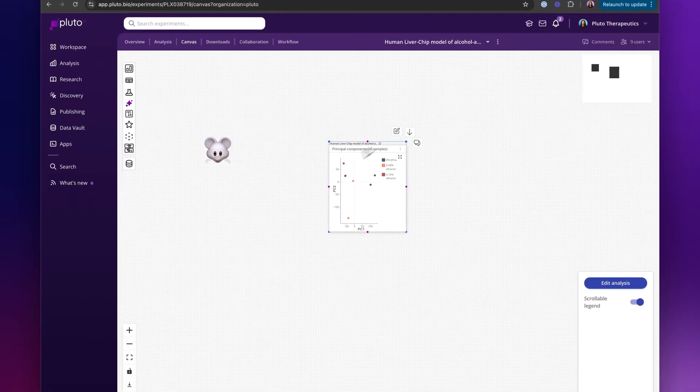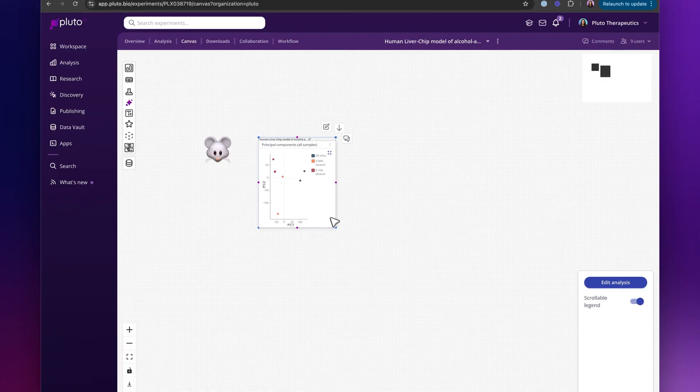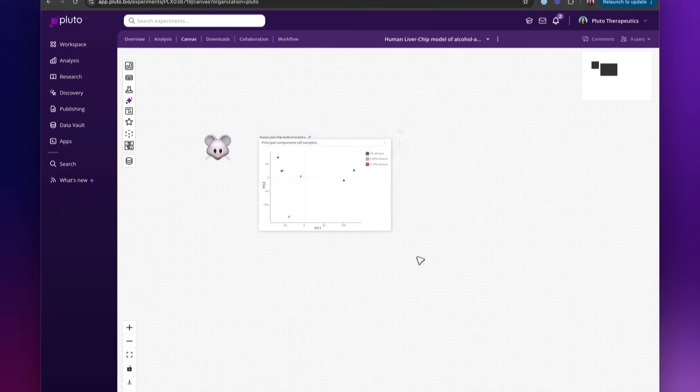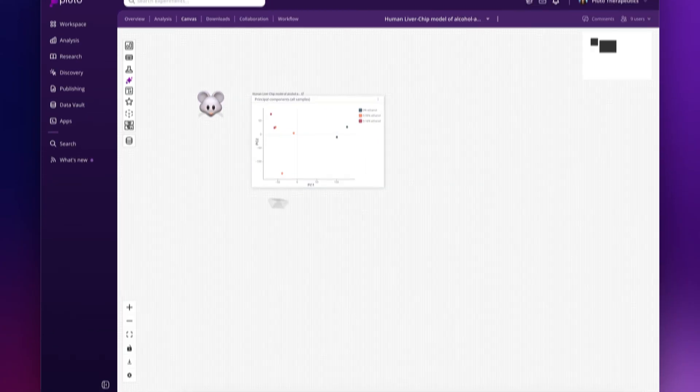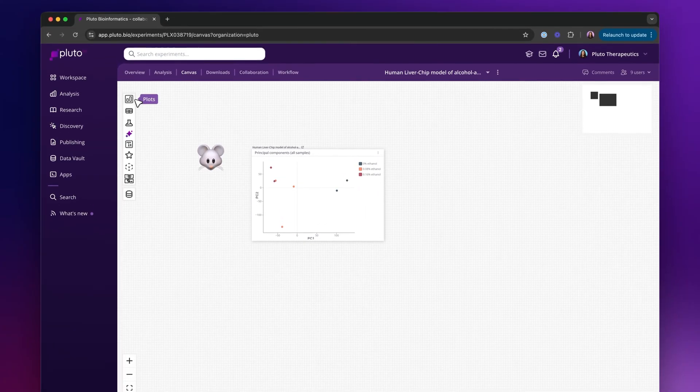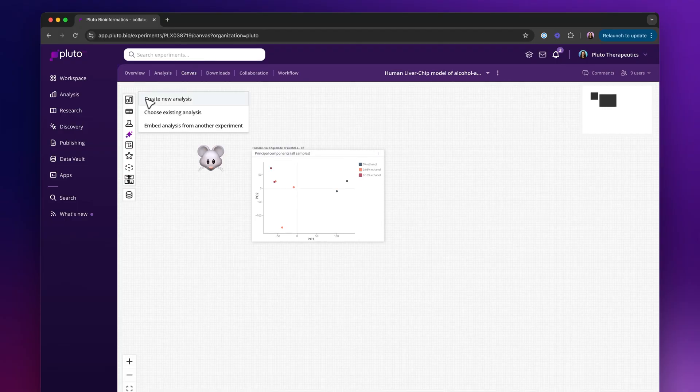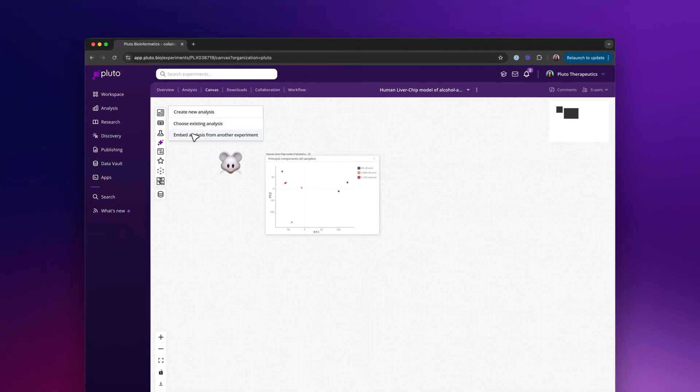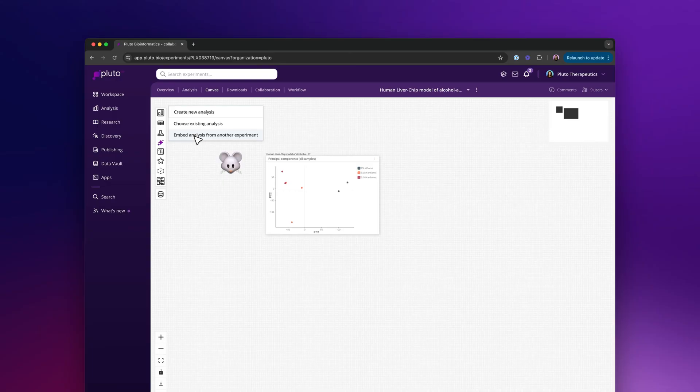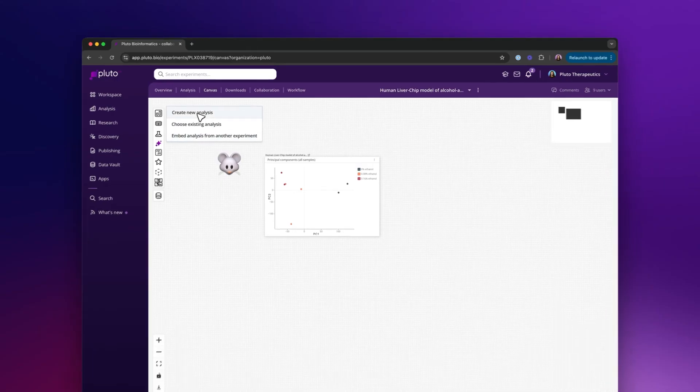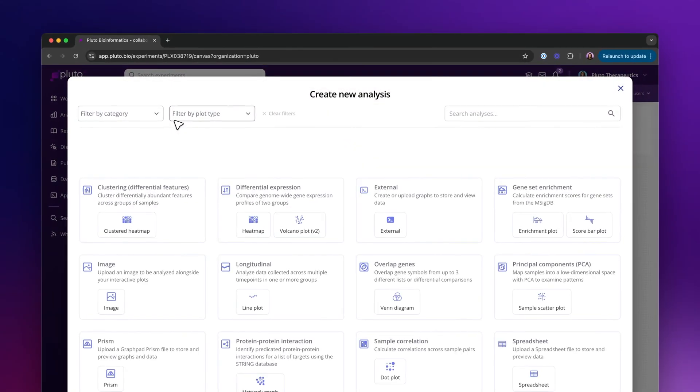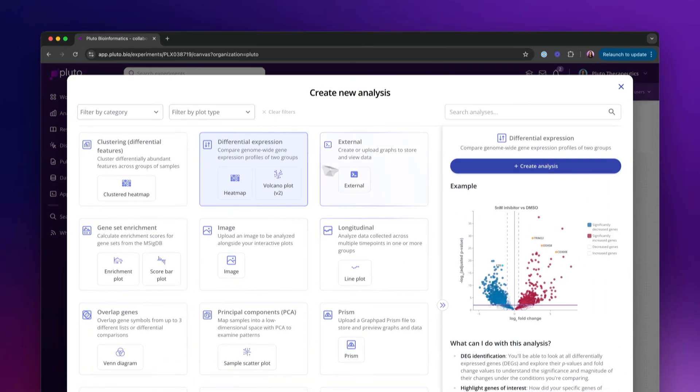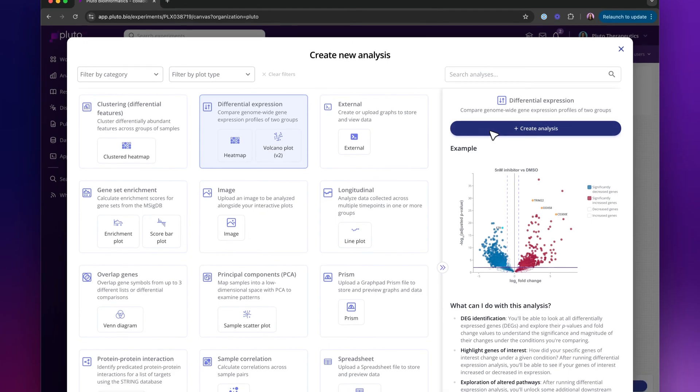Now that graph is on my canvas, I can continue building a multi-panel figure. I can choose an additional analysis, create a new analysis, or embed an analysis from another study even. I'll add a few more so that we have some comparisons.